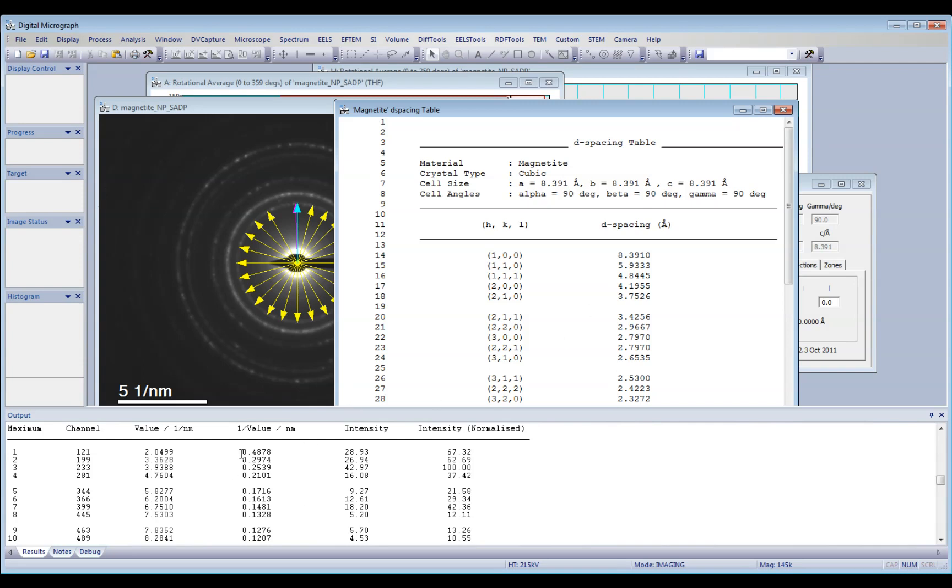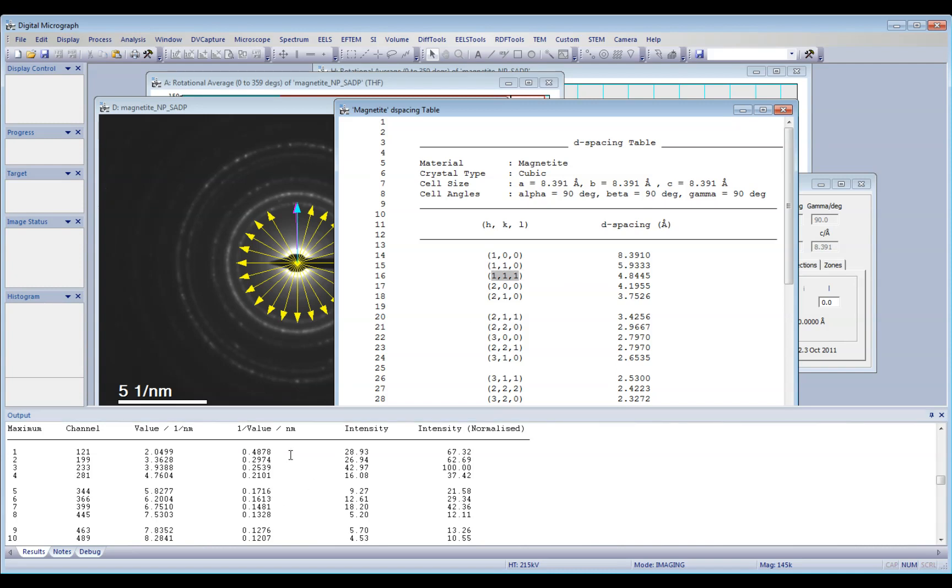For example, in my case, I measured 0.4878 nanometers, that's actually 4.84 angstroms. So this is the 1, 1, 1 plane. So we start to identify those planes.